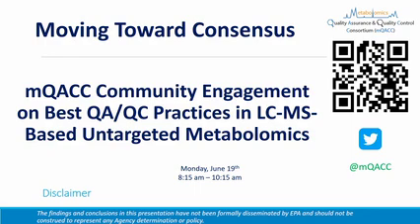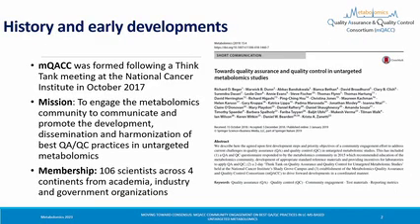I am Jonathan Mosley. I'm very happy to welcome you to our workshop titled Moving Towards Consensus. We're going to be talking about best QA/QC practices in LC-MS-based metabolomics. And just to give you a little bit of background, we are all from an organization called the Metabolomics Quality Assurance and Quality Control Consortium, or mQACC.